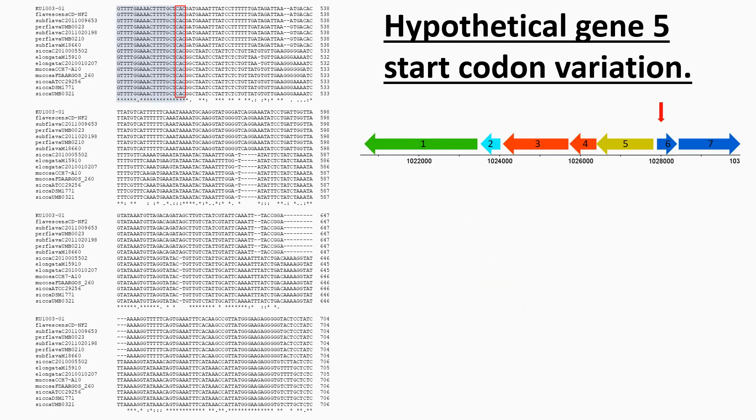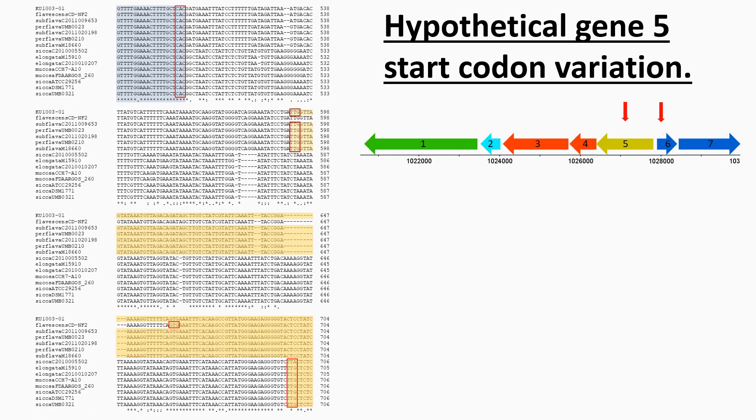Here I've highlighted, this is actually shown the other way around previously. So this is hypothetical gene six with a GTG start codon there. Here it's shown as CAC there. But when it came to predictions for hypothetical gene five, I found that there was some variation.